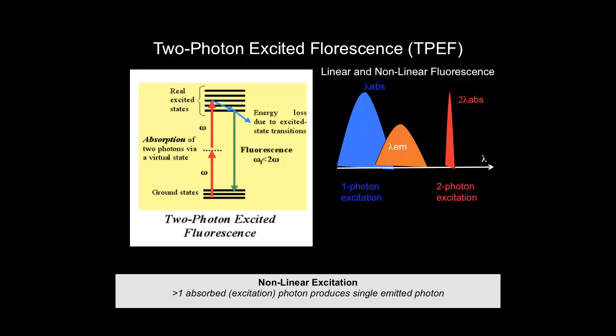So I think traditionally, two-photon fluorescence is described as a process where the excitation is linked to the square of the intensity. The square of the intensity arises directly from the probability of having two absorption events simultaneously, which is directly proportional to the intensity squared. And that is then linked to the spatial confinement you get in the focal volume.